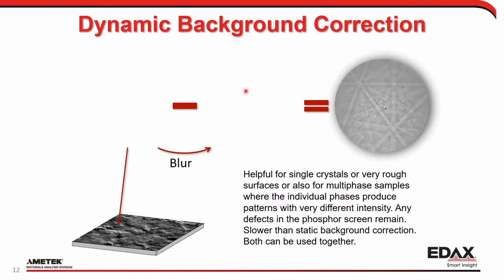Now, this right here is what you usually see with an EBSD pattern. Again, nice and flat field. And you can see here that it's a nice dirty phosphor screen because, hey, phosphor screens do get dirty or damaged over time, and that's kind of what they do. So again, the computer doesn't really care about these, they're just there.